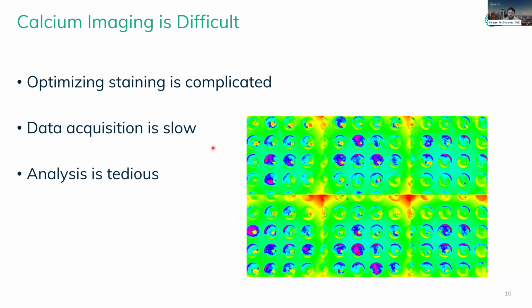Looking back at my career, the data acquisition was always challenging for me because we had an imaging platform from one vendor, a stimulation platform from another vendor. The microscope stage was probably made by somebody else. So we had several pieces of software to control all of these. Then when we did the acquisition, they all had to communicate properly to provide the data output.